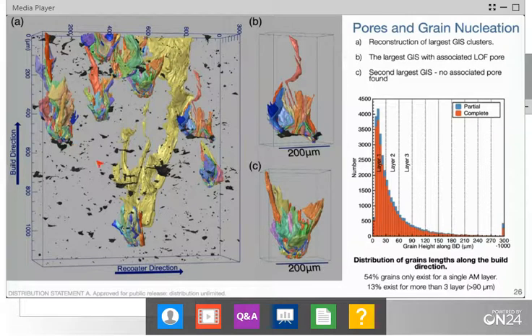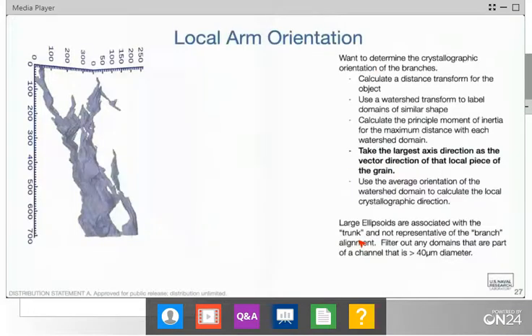We found that to be a very interesting result, and it was a fun thing to see how these grains cluster and the pores cluster, but we think that most likely this is due to some poor alignments of the AM structure, or some poor raking of the powder during that part. And we're not sure if that's associated with the gas flow or if that's associated with the lineup of the raster direction with the other features, but that's what we saw.